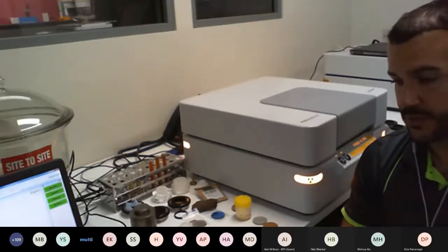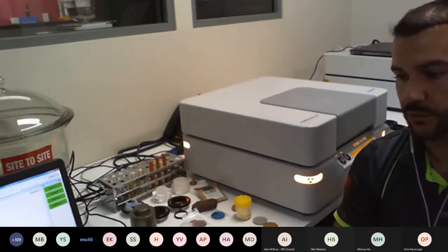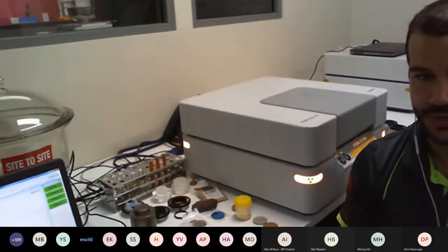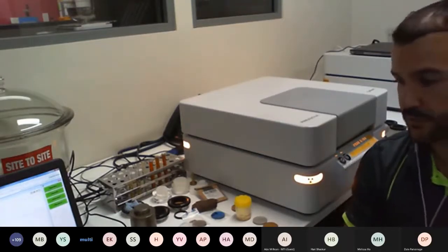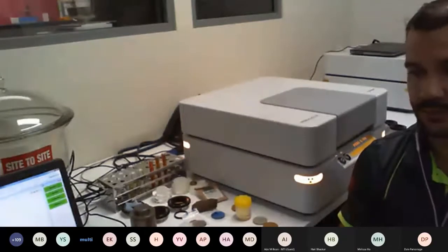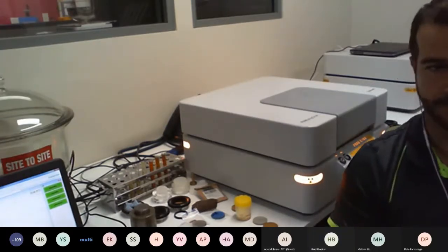And so you present your sample into a location, you select the automatic program selection application. It will quickly scan the iron and magnesium, and then based on those results, just on the count rates that are there in the sample, it will choose automatically whether it needs to run the saprolite program or the limonite program, which is a great feature because it can take the guesswork out of your samples to know which is the best program to analyze them on when they've been processed through the laboratory.